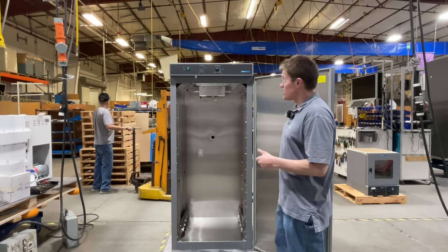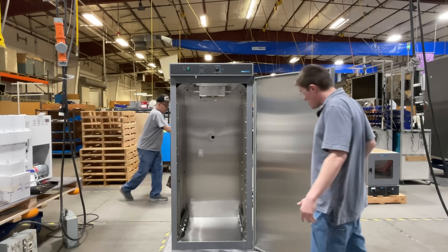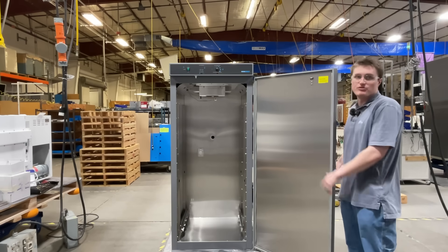The chamber is constructed out of corrosion-resistant materials to help increase the longevity of your product. Additionally, it is important to note that all shelves must be properly slid into the unit before closing the door.